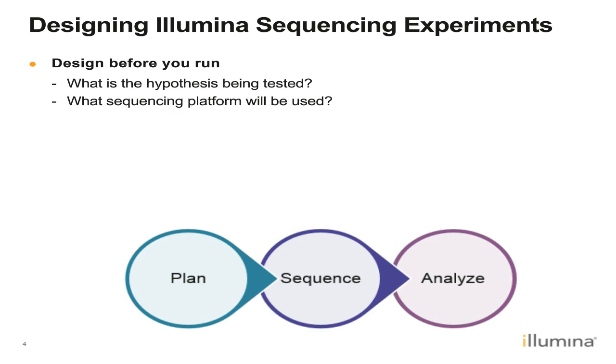Another very important consideration is what sequencing platform are you going to use, or do you have available? As you may know, a NovaSeq will produce a ton of data compared to an iSeq, but a MiSeq, for example, can run longer read lengths than, say, a NextSeq. So again, these platform ideas and considerations also become very important in how you're going to perform your analysis.